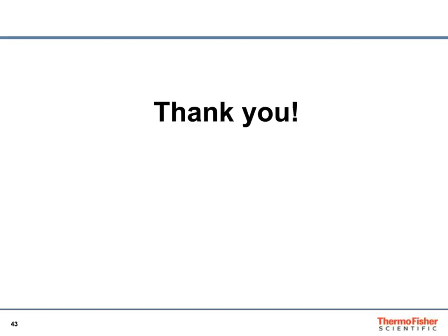Now, Kate, why is high-resolution mass needed for extractable and leachable analysis? This person says, my lab's been using LC-UV for E&L analysis for quite some time now. Yeah, that's actually very common in the industry. Yes, a lot of people are just using the UV, but as I point out, a lot of the time you are dealing with unknowns.